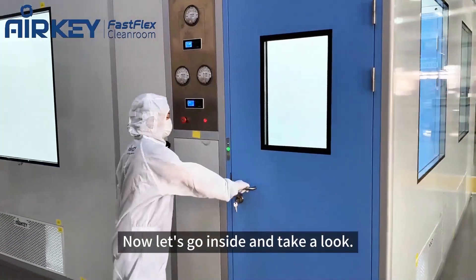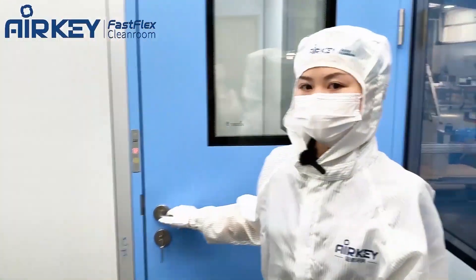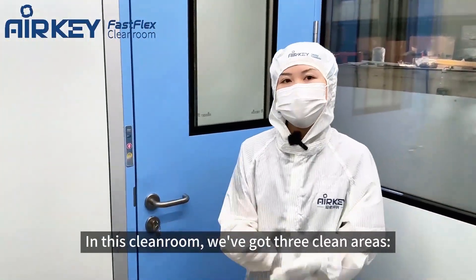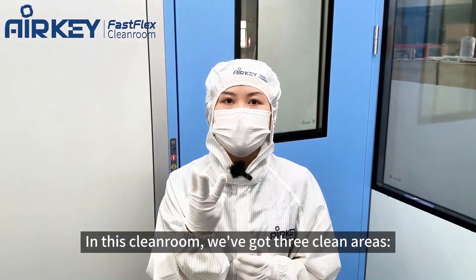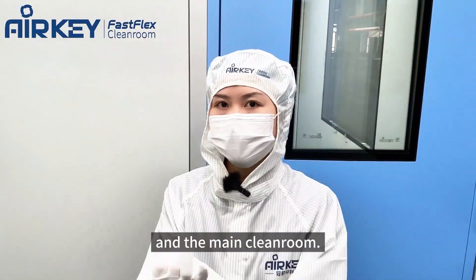Now let's go inside and take a look. The shed doors between the rooms are interlocking. In this clean room, we have three rooms: one is the dirty ante-room, one is the clean ante-room, and one is the main clean room.